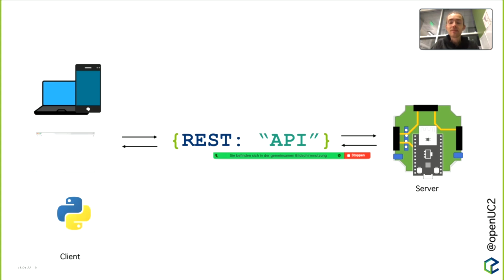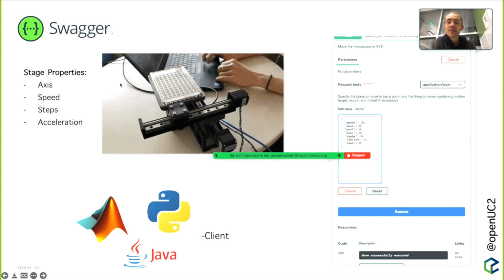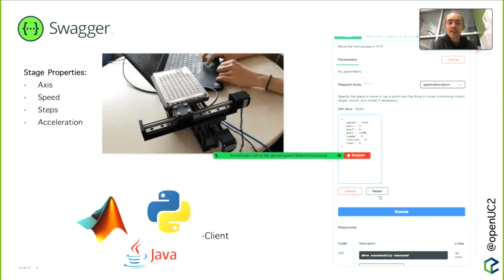And so we thought it might be very interesting to follow this idea of having microscopy oriented around this framework, because it's unified, rather simple to implement, and accessible from many different platforms. Also following the idea from Richard Bowman's OpenFlexure, which is moving along the same principle. What you have here is the ESP32 interacting as a web server, which hosts a web page.